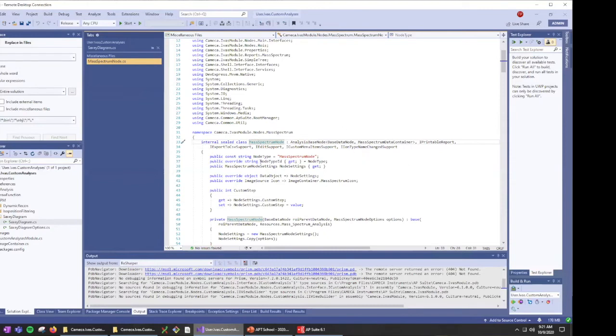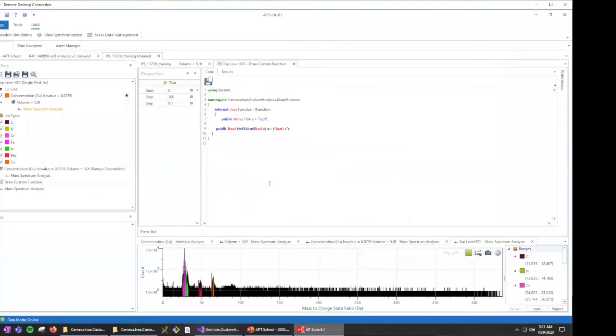So it didn't completely get rid of the IVAS name. Right. No, the APSuite is the overarching application, and IVAS is a module inside it. It's a module in the APSuite. Yes, okay. Yes, exactly.